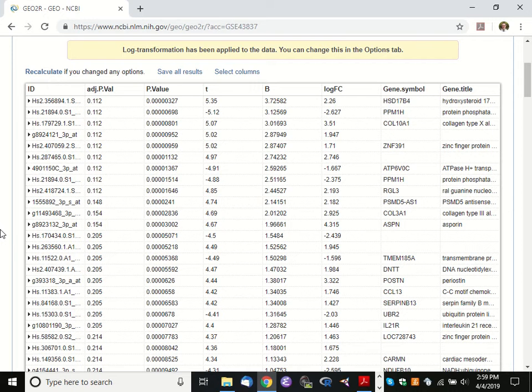Yes and no. I'm seeing heads shaking and people saying yes. Okay. Well, I would just point out that adjusted p-value here is rounded to 3 decimal places. So we have like 205, 205, 205, 205, for example. Okay, so the orders should be the same in this case. All right, so why are these two values different in this case?